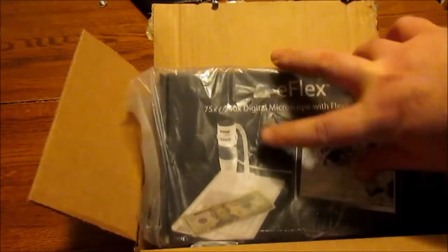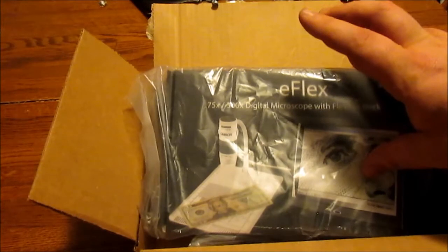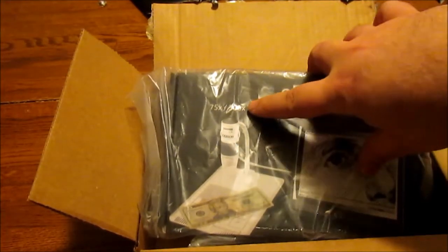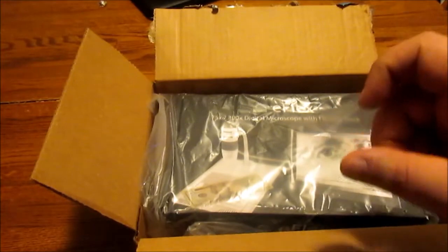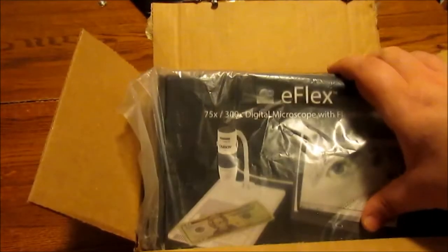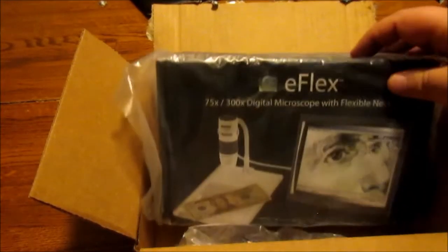I ended up going with this one because it's very similar as far as the base and the neck go — I assume it's probably the same manufacturer somewhere down the line. But this one has the better 300x magnification, and in the reviews I watched they were able to actually use it as a handheld device, which is important to me because I bought this almost specifically to check out trichome development.